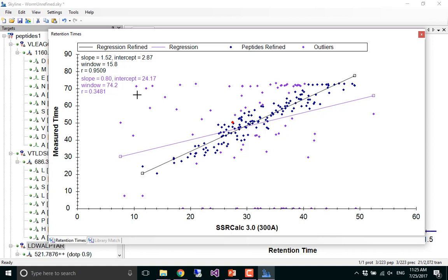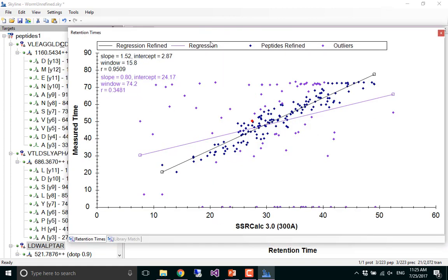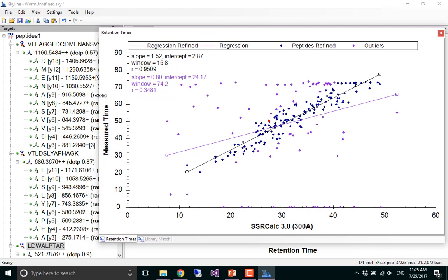Well, I've never commented on this before, but I just noticed that there's a line here at about 70 minutes, which isn't really quite the end of the chromatography. But things seem to be lining up there. Where else are there interesting points? Yeah, 0. What does it mean? What do people think that means? They didn't stick to, so did they come out at 0 or what?